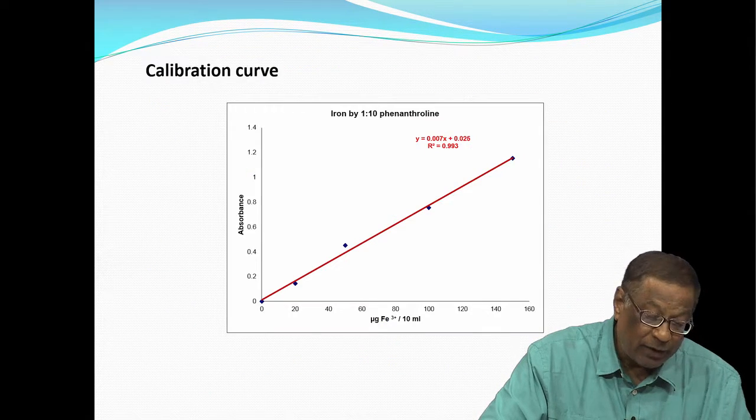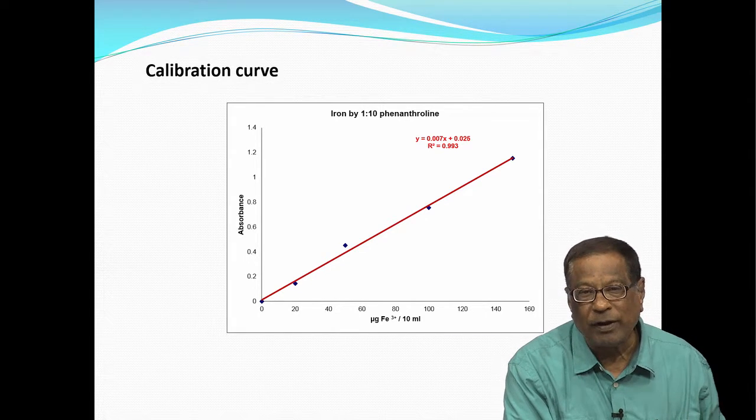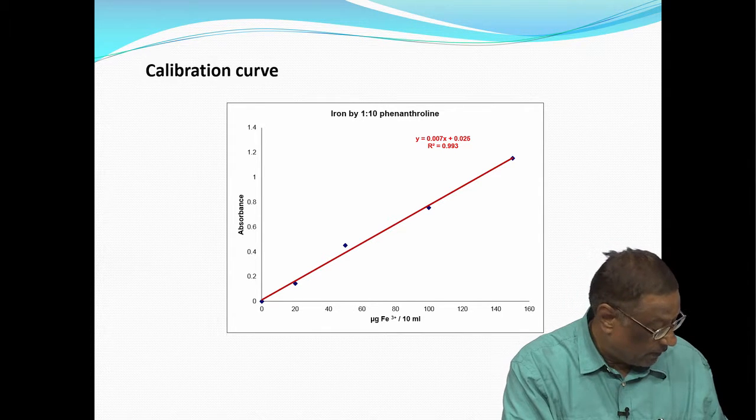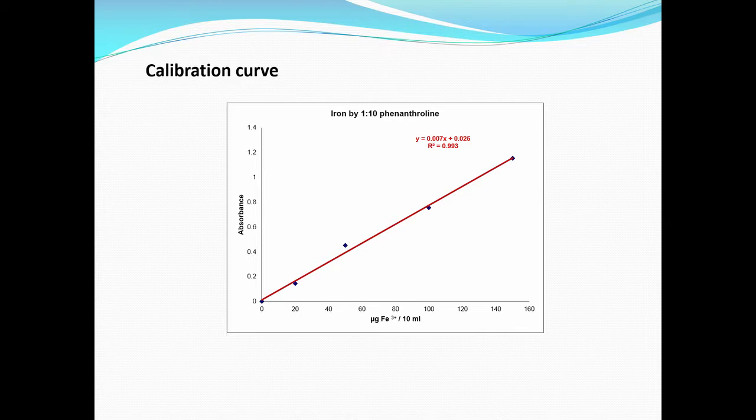Now, I would like to give you some information about the interference of other elements, and I have to tell you that magnesium, lead, fluoride, manganese, iron, iodine, aluminum, sulphate, nitrate, phosphate, tartrate, chloride, vanadium, molybdenum, borate, sodium lauryl sulphate, and Triton X-100 did not interfere. But then what sort of things will interfere in this method?